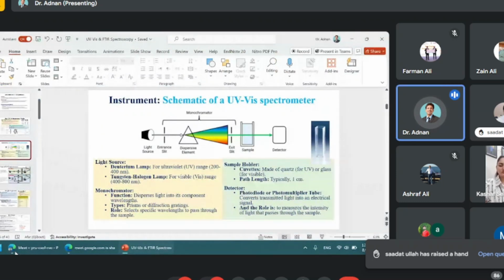Sorry, I missed some points in your explanation. You were saying that, let's suppose, I'm measuring the concentration of methylene blue. Yes, clarifying the question. After you have taken initially 100 ppm, let's suppose 20 ppm, to make it very easy.